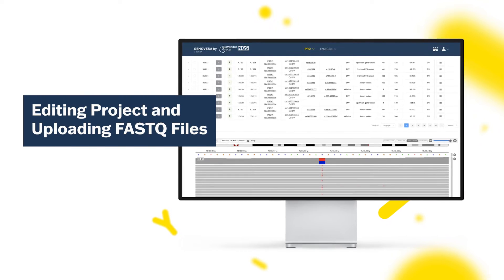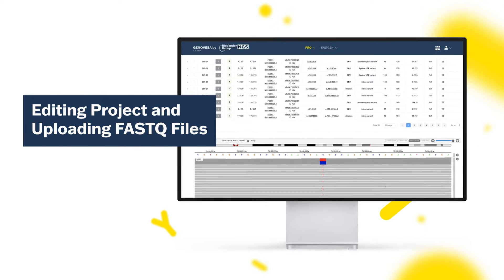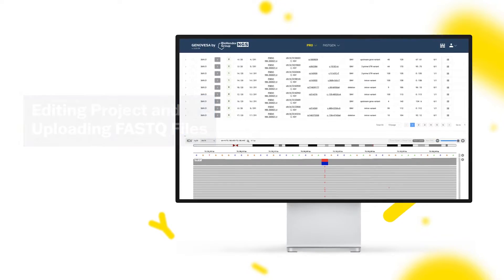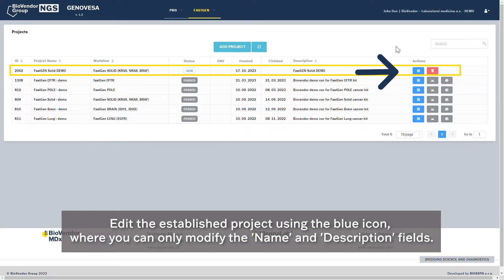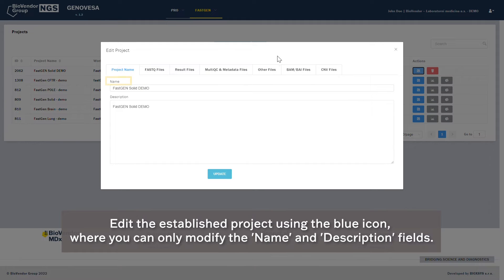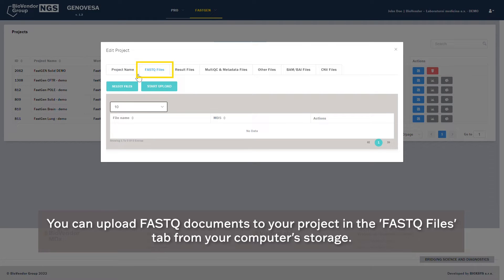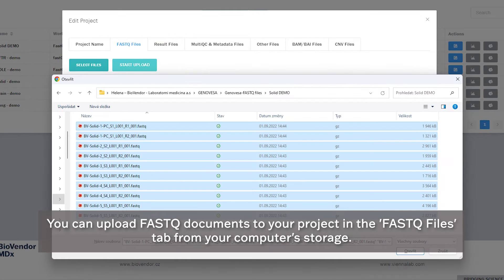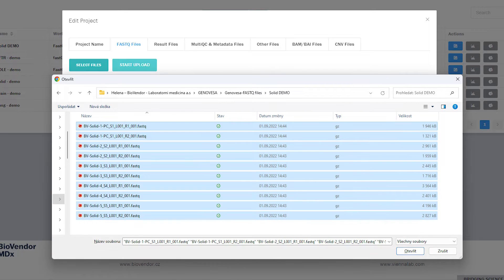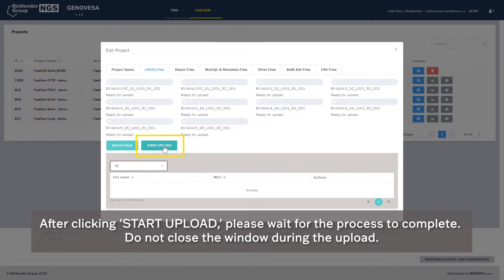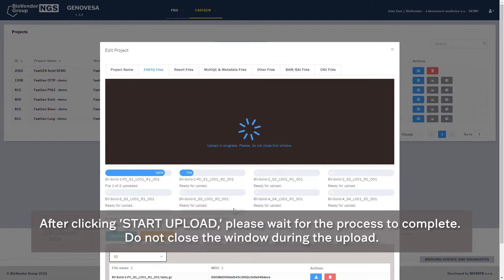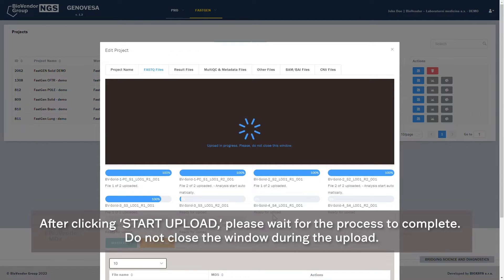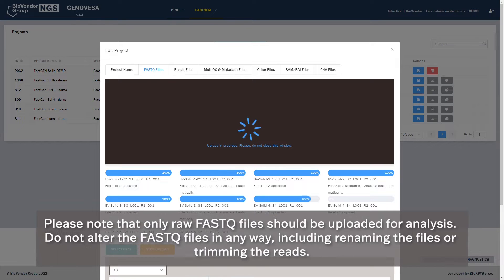Edit the established project using the blue icon, where you can only modify the name and description fields. You can upload FastQ documents to your project in the FastQ Files tab from your computer storage. After clicking Start Upload, please wait for the process to complete. Do not close the window during the upload.